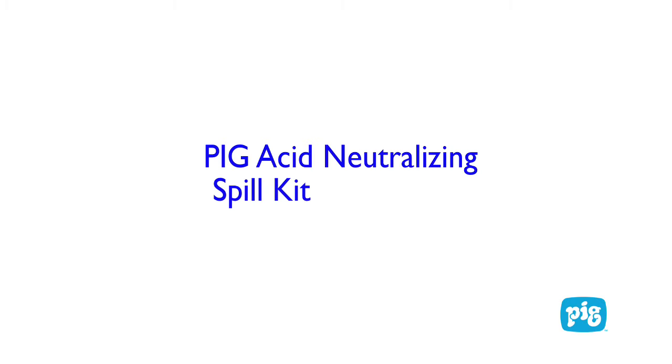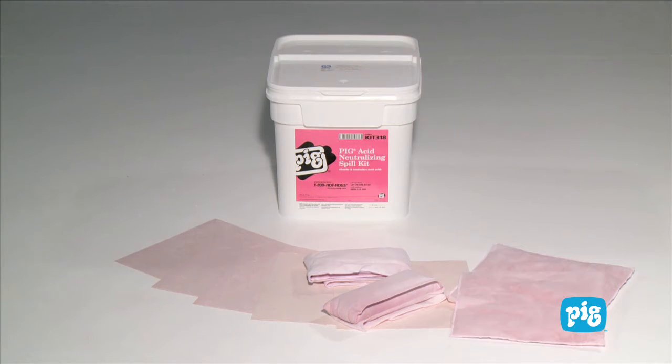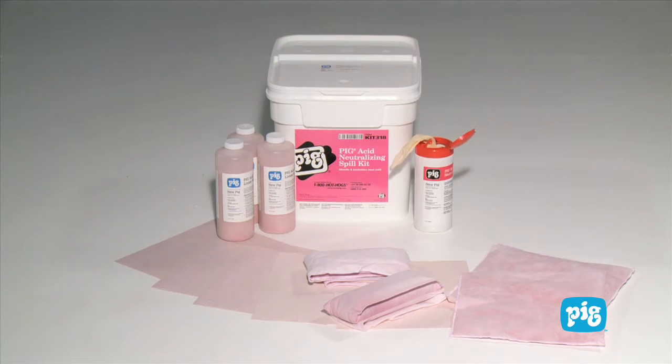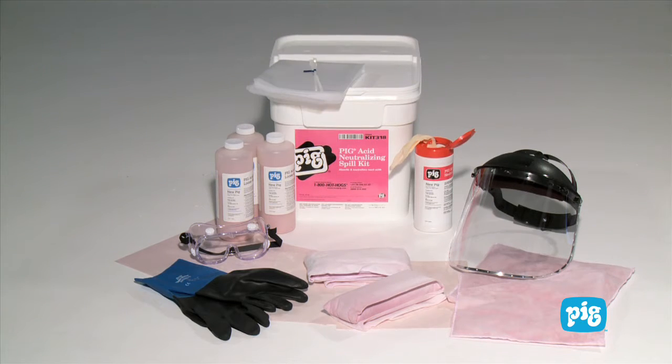Pig Acid Neutralizing Spill Kit in a Bucket. In your kit you'll find absorbent mat pads, socks, pillows, loose absorbent, wipers, face shield, goggles, gloves, and disposal bags.